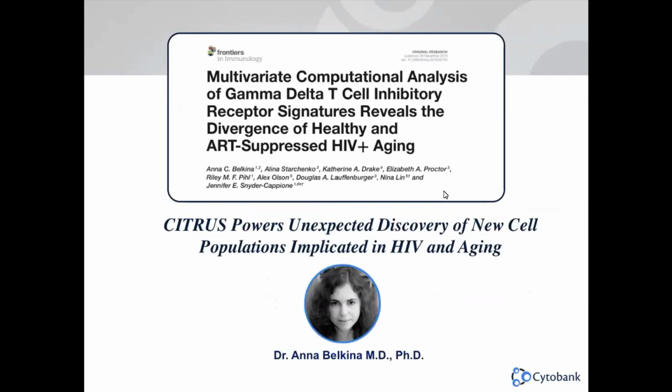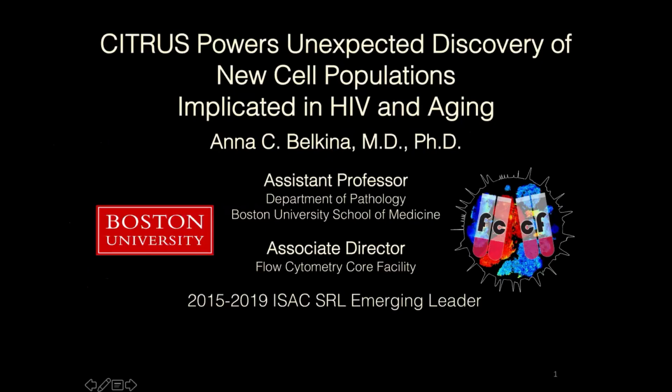So here I just showed you options for how you can use Citrus and some of the data visualization and interpretation tools within Cytobank. If you have any questions, I'll be happy to take them during the Q&A session. But without further ado, I would like to turn the screen over to Dr. Belkina for her talk. You will see how Citrus was applied to her study, making an unexpected discovery in the HIV and aging cohort. Anna, it's all yours.